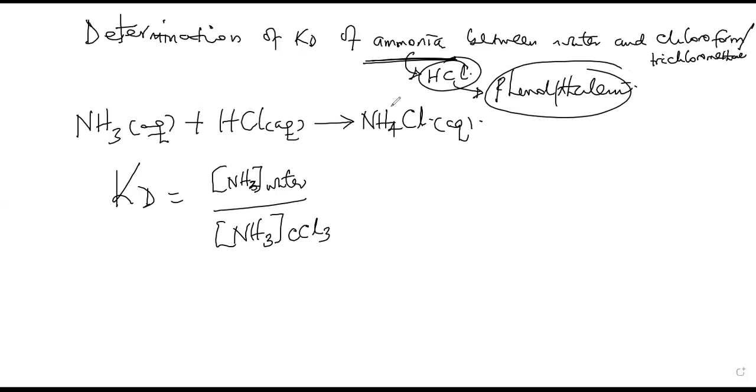Are we together? Why did we this time pick from the organic layer? There is no harm in picking from the aqueous layer, but we are looking at the type of reaction. You have ammonia, then an acid, giving ammonium chloride. Still, it has no harm.